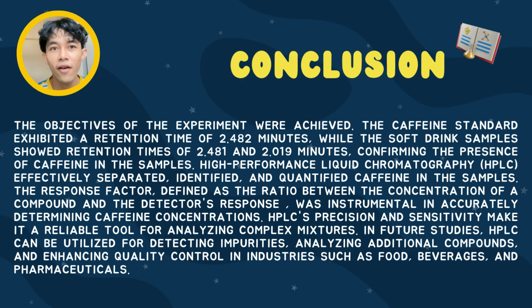The response factor, defined as the ratio between the concentration of a compound and the detector's response, was instrumental in accurately determining caffeine concentrations. HPLC's precision and sensitivity make it a reliable tool for analyzing complex mixtures.